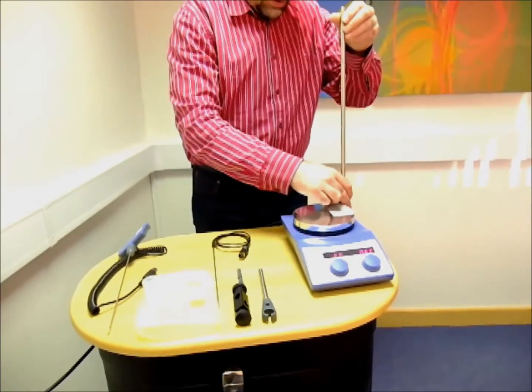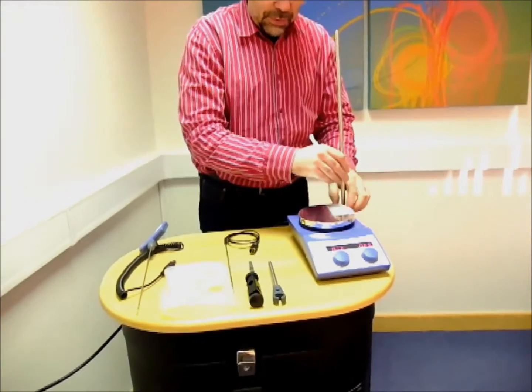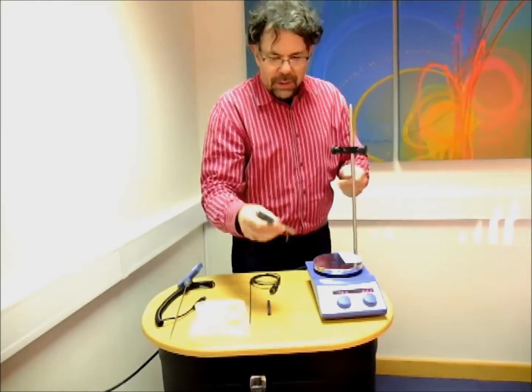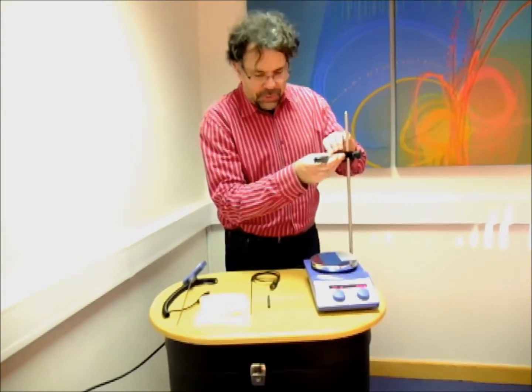Firstly, we have a very nice retort rod that comes with the package, so you can mount things directly onto the hot plate keeping your fume hood tidy, a boss head, and also very usefully this little clamp that holds temperature probes.